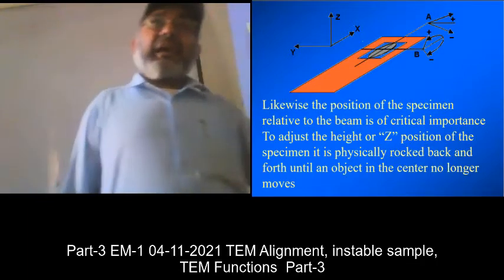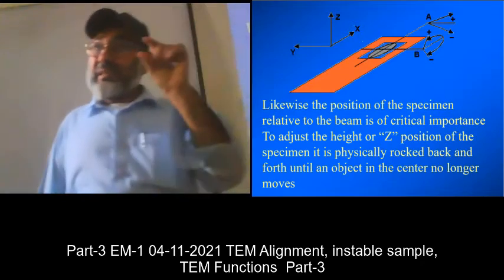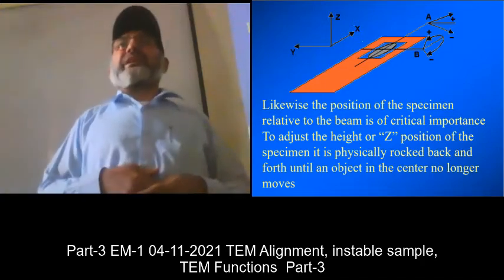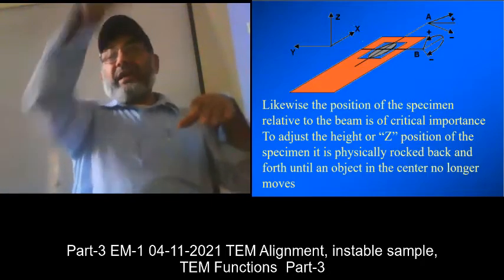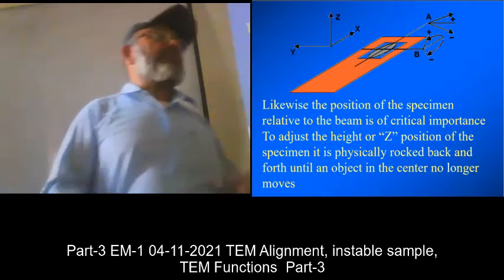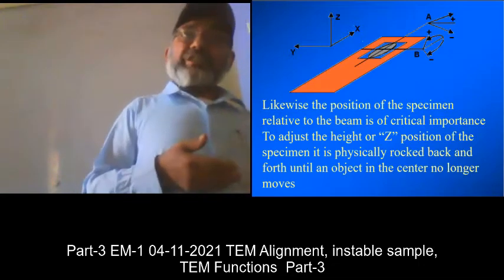You select a feature in your sample. This is the room, and I selected those set of plugs there. And when I move the room like this, that specific feature is not changing position, because I need a distinguishable feature to start from, to focus upon.